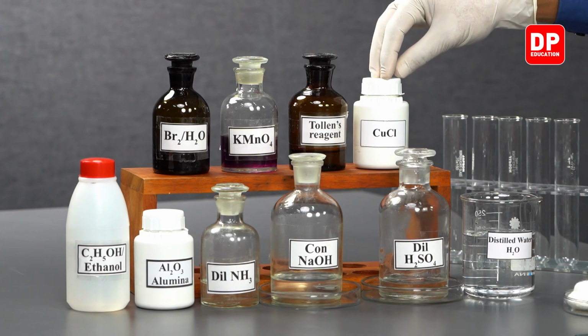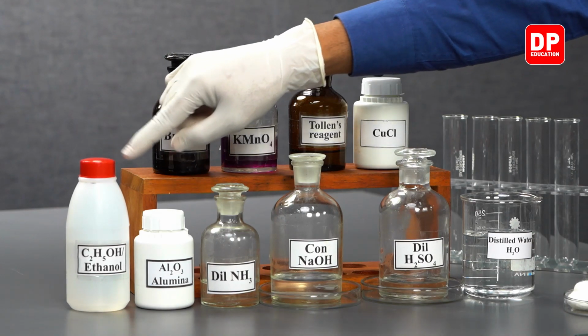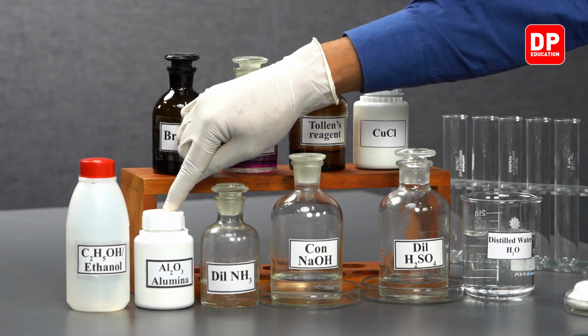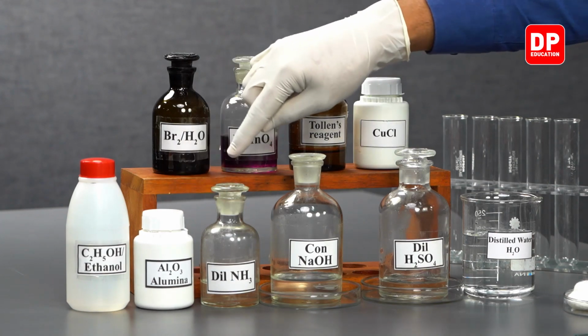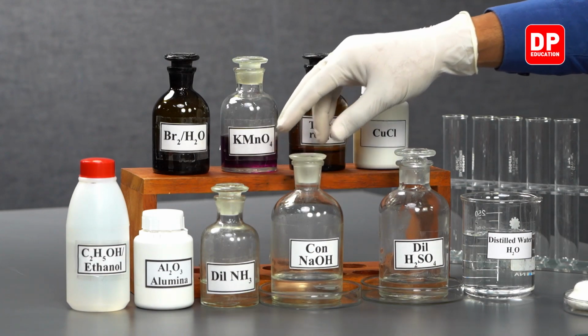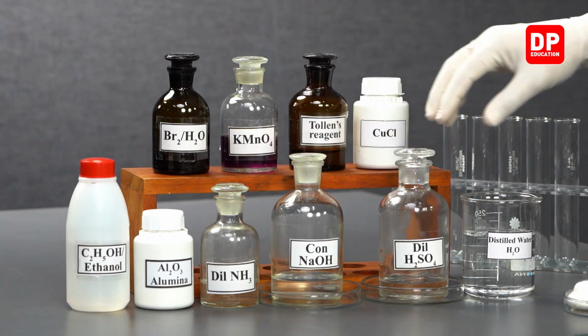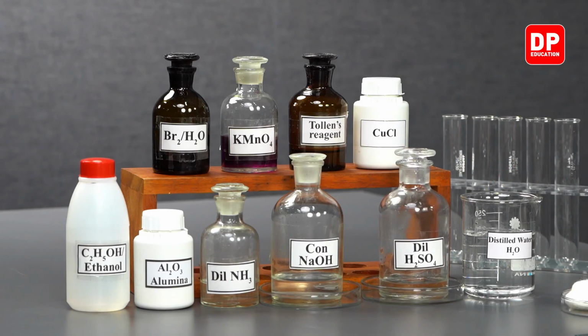We have cuprous chloride, CuCl. We have ethanol, anhydrous aluminum oxide, also known as alumina. We have dilute ammonia, sodium hydroxide, sulfuric acid, and distilled water.